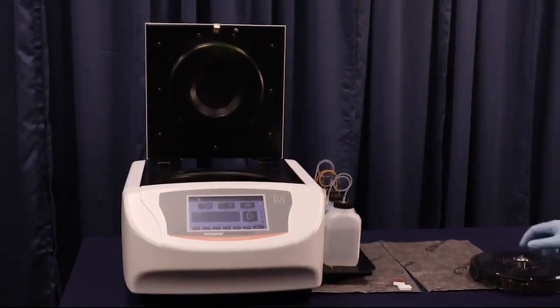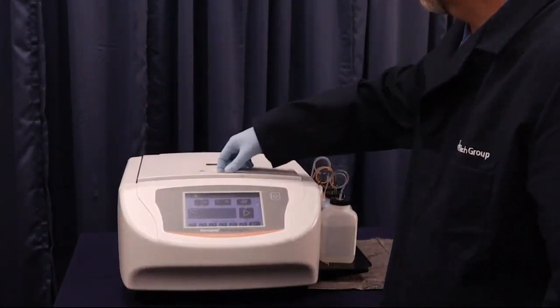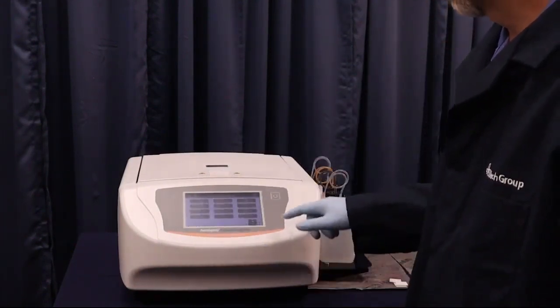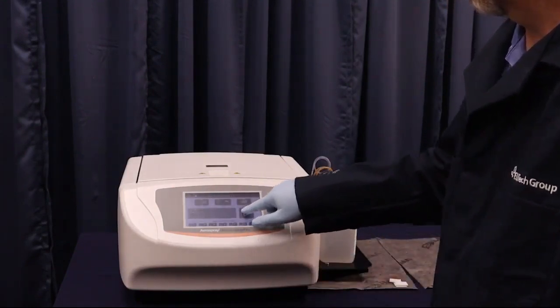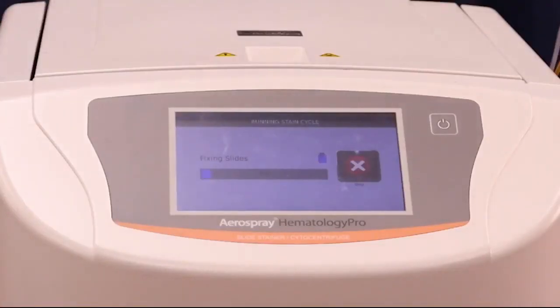To start a run, simply load the carousel into the chamber and close the lid. There are several programs to choose from, but you may also edit your own protocol to your preferences. The instrument begins by fixing the slides. All fixing and staining of the slides is achieved by rotating the carousel around the center hub while spraying reagent onto the slides. After the slides have been fixed, the instrument applies a mixed concentration of thiazine and eosin to the slides. Each program can be customized to have a different number of stain applications, wait times, and spin settings.